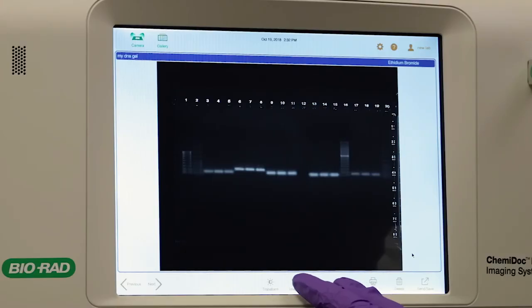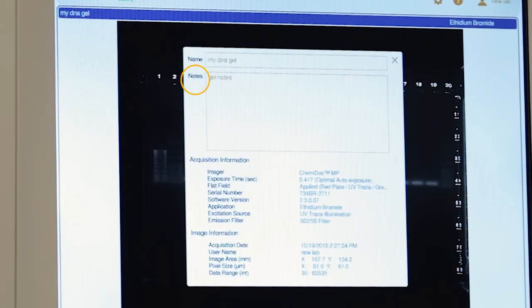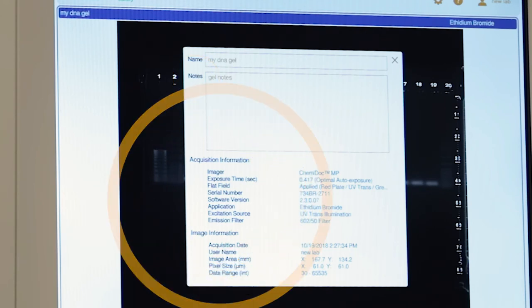When you choose the Image Lab file format, your custom name and notes, as well as all the data indicated below, are exported to Bio-Rad's license-free Image Lab analysis software, which is available for both Mac and PC.